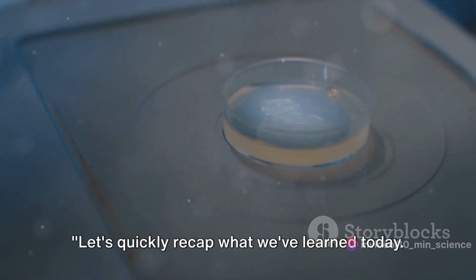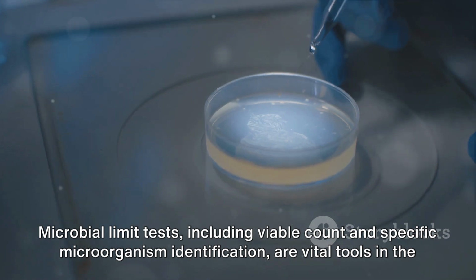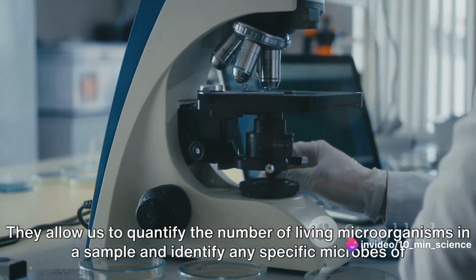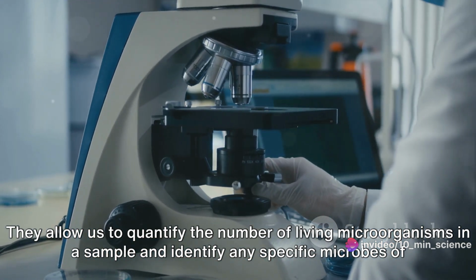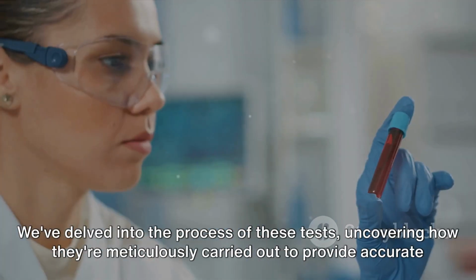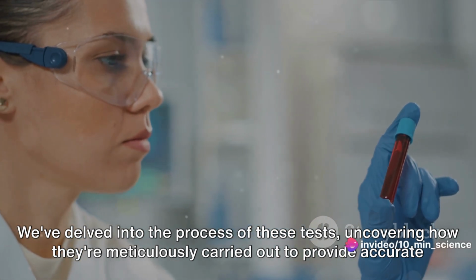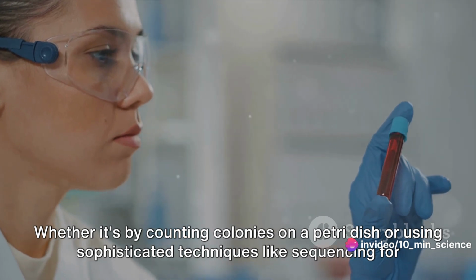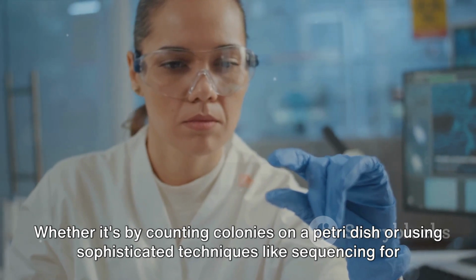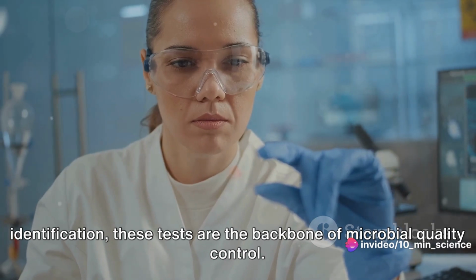Let's quickly recap what we've learned today. Microbial limit tests, including viable count and specific microorganism identification, are vital tools in the pharmaceutical industry. They allow us to quantify the number of living microorganisms in a sample and identify any specific microbes of interest, respectively. We've delved into the process of these tests, uncovering how they're meticulously carried out to provide accurate and reliable results. Whether it's by counting colonies on a petri dish or using sophisticated techniques like sequencing for identification, these tests are the backbone of microbial quality control.